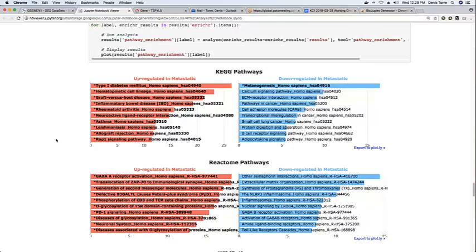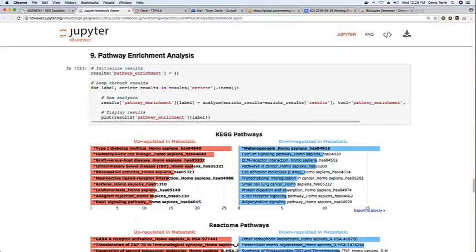And so the idea is that a user which is interested in rerunning the analysis itself can simply download the IPython notebook file, the Jupyter notebook file, and rerun it on its local machine.